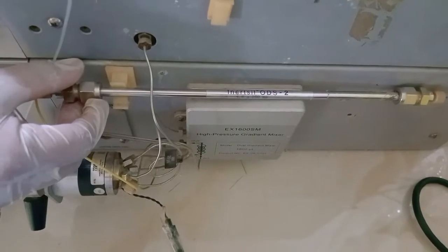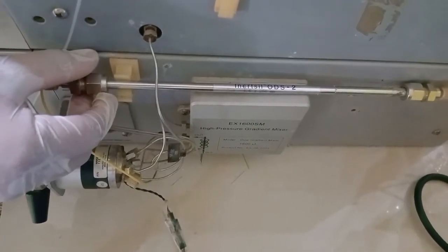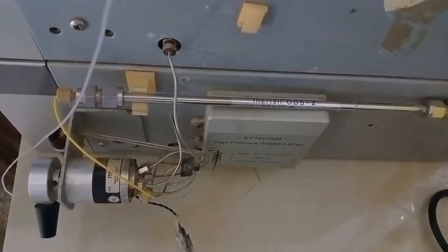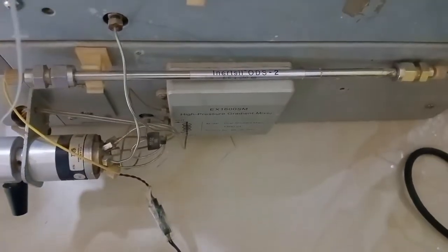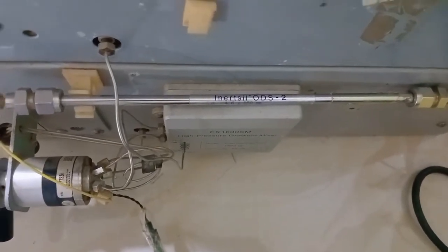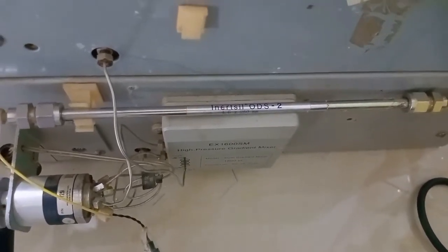The fourth component of the HPLC is the column. The column is the heart of the HPLC, where the separation of the components will occur. Proper selection of the column, that is, the chemical nature and dimensions of the column, will affect the resolution, the speed of analysis, and the peak symmetry.